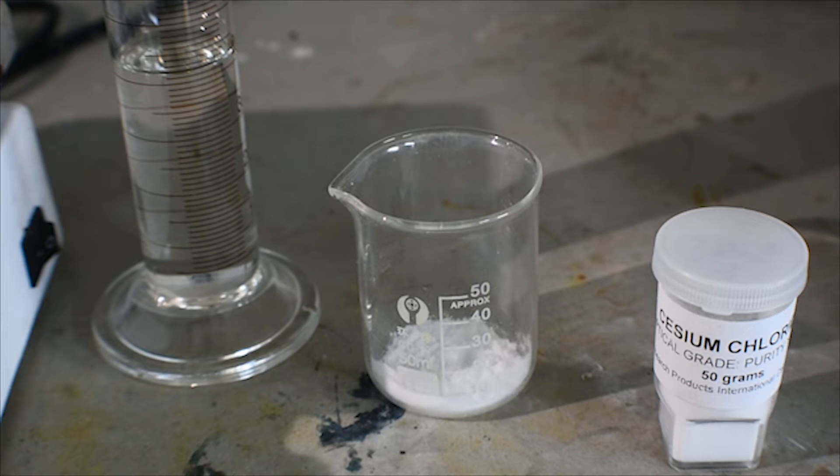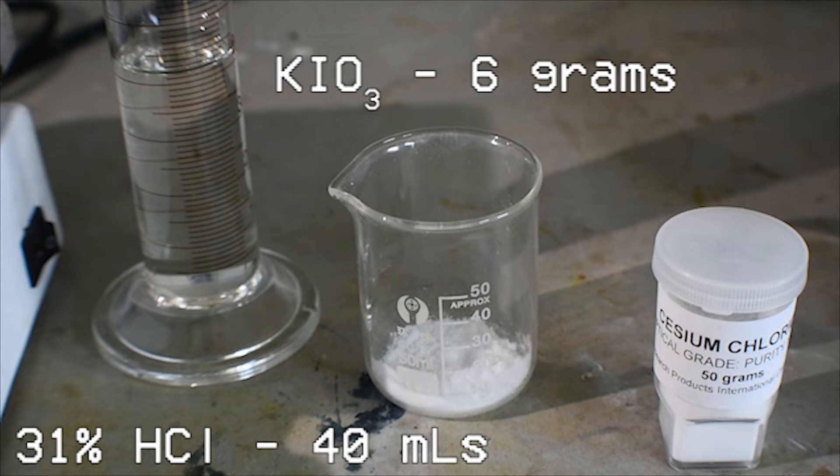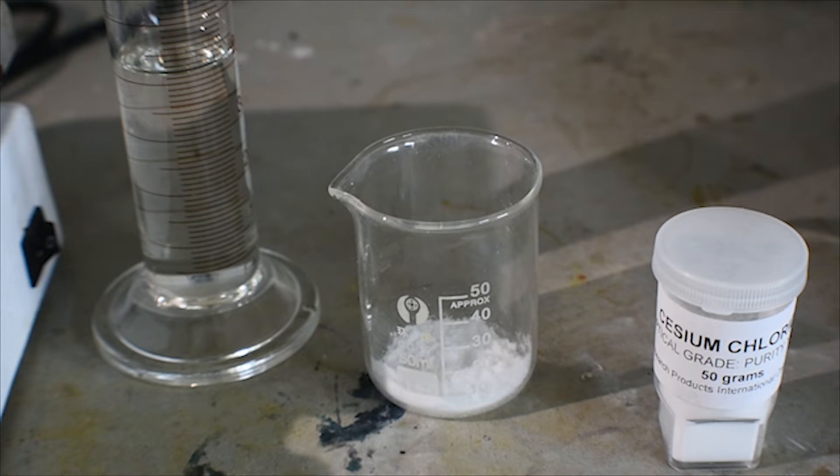The quantities I'm using only really matter for the first part, which is making the potassium tetrachloroiodate. The quantities of the reagents that we will need are 6 grams of potassium iodate and 40 milliliters of 31.45% hydrochloric acid. We will use as much cesium chloride as we need to convert all the potassium tetrachloroiodate to the cesium salt.